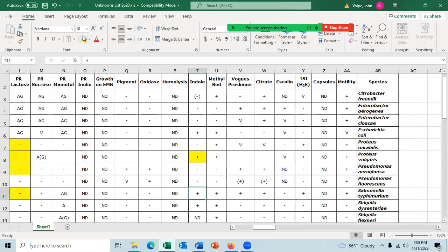And so you would remove this one and this one from consideration. Okay, and that's kind of how you do it. You go through the table, see what your results are, figure out what is what, and then highlight them or just remember which ones are under consideration. Now we've narrowed it down to two, and we removed half of them from consideration.